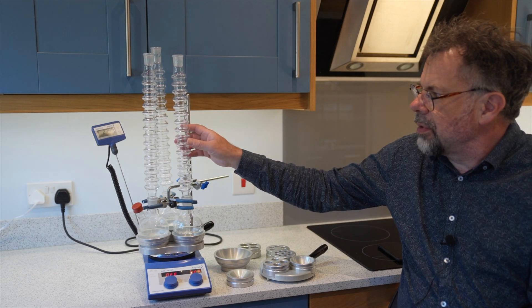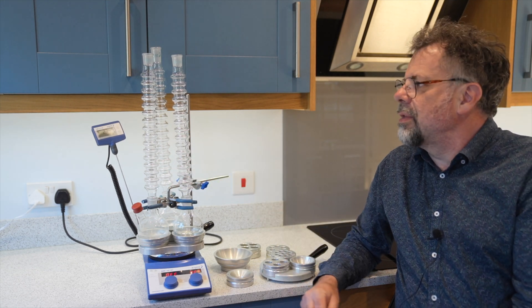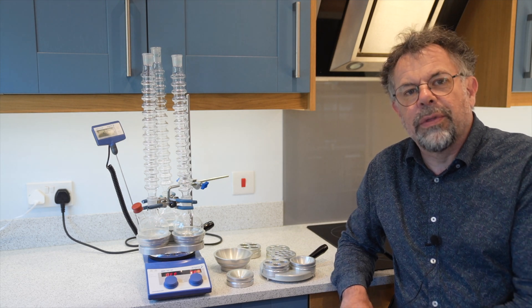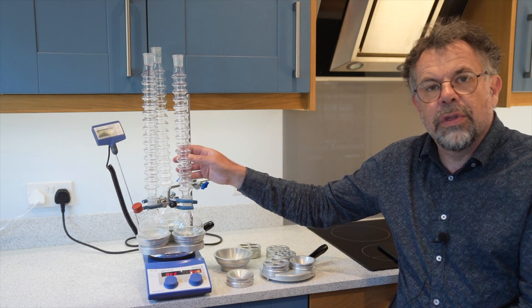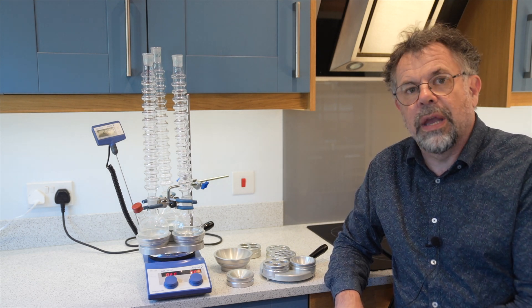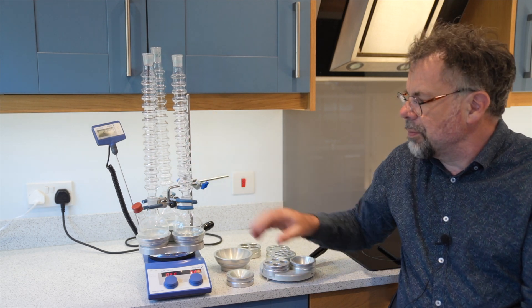To enable a chemist to have a minimum of hassle, I've put on here three of our condensing units. These allow you to perform reflux experiments without the need for any water usage. These air condensers work just as efficiently as the average Liebig condenser, allowing you not to worry about water spills, using a lot of expensive water, and of course the dreaded flooding overnight. This makes it a lot safer, more practical — there's no plumbing, it's a very simple setup.